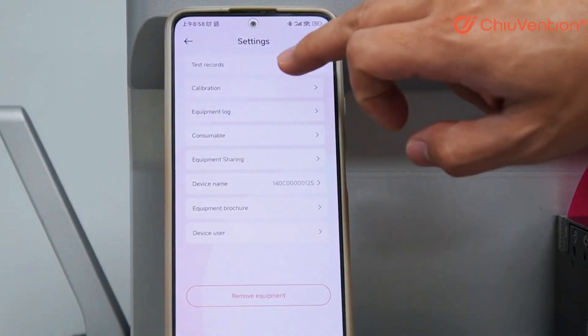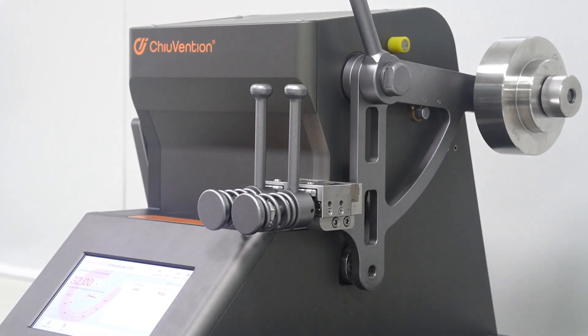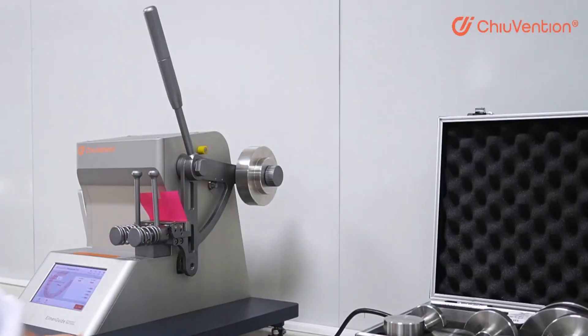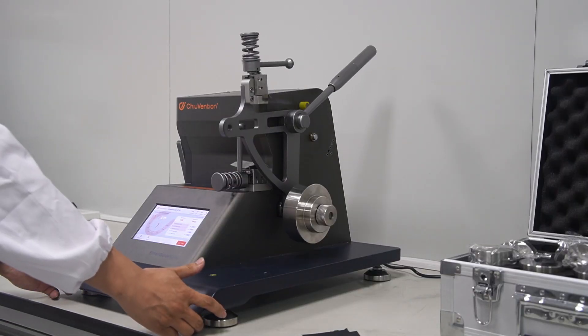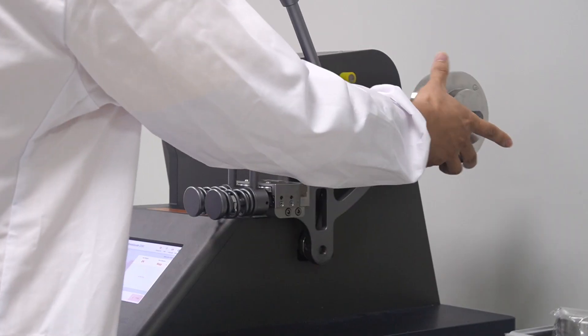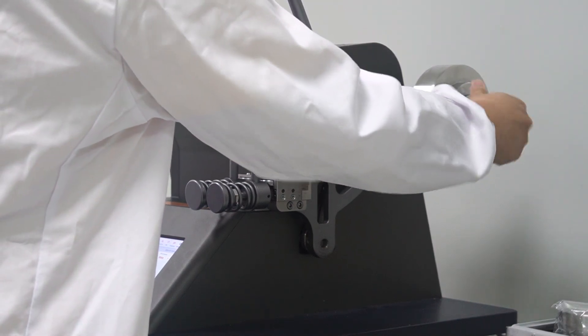Set parameters, monitor tests, and receive essential alerts, all from your smartphone. The innovative balance pendulum plate design ensures the highest level of testing accuracy. With the center of gravity perfectly aligned, achieve reliable Elmendorf tear strength tests every time. This tearing strength tester automatically recognizes attached weights, adjusting effortlessly to the correct force range for optimal testing.